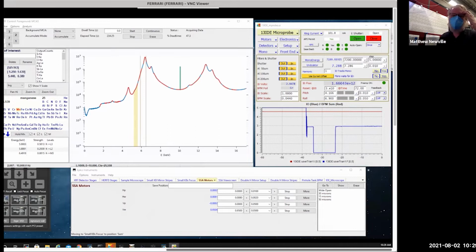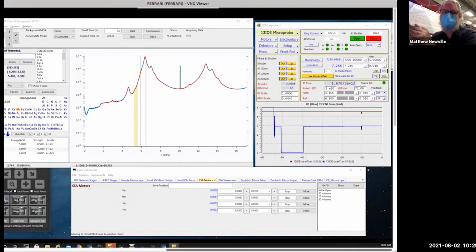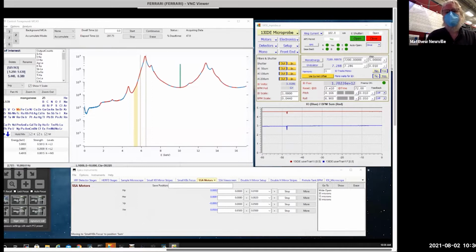One thing you may need to pay attention to, especially for transmission XAFS, is that when we measure transmission XAFS with ion chambers, the ion chambers are very good at counting the number of X-rays. The X-rays get absorbed. That creates a current. There's an ion and an electron. There's a voltage across the plates that sweeps out the carriers. That makes a current. Then we take that current, it's a low current, in the nanoamp range, or maybe microamps, and we want to amplify that and turn it into a voltage so that we can integrate it for some amount of time, let's say a second, and the total voltage that we collect over that time, or the total current, is a number that's proportional to the number of X-rays.